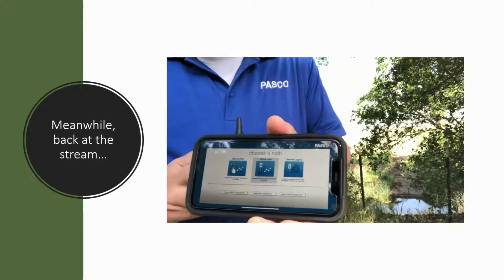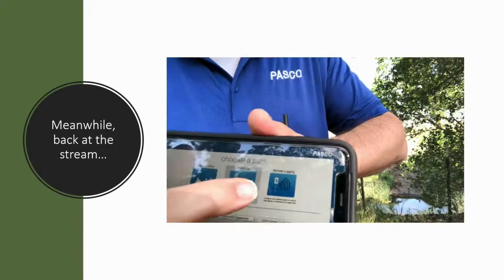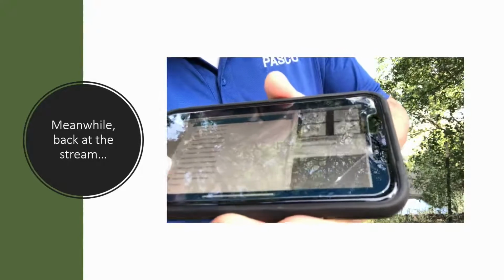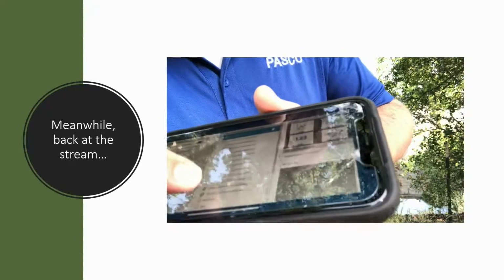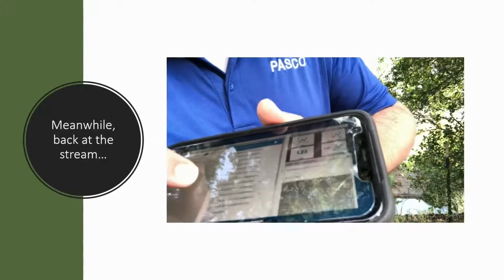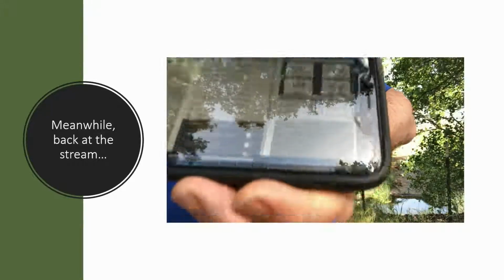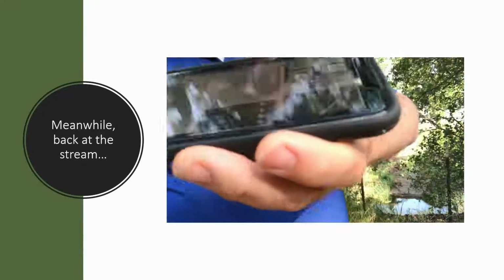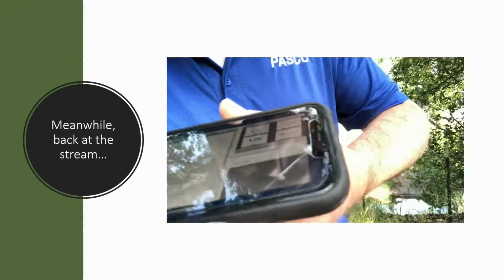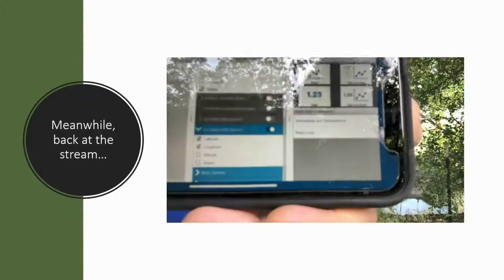On your phone, you'll just click that to start it. It's an app that you can get from your app store. You're going to choose the sensor type here. All right, it's going to have one default check, so we're going to uncheck those. And below we're going to choose instead to look just at the nitrate levels. So you're going to just check nitrate levels, and I want to get the GPS signal, so let's turn that on as well by hitting that little button, and we'll choose latitude and longitude.